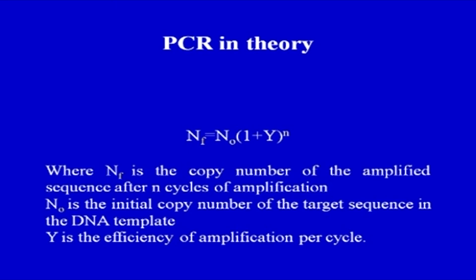All right. So, let us get a little bit into the details of the PCR technique. When amplifying a small segment of a large double stranded DNA template, the desired fragments first appear in the third cycle of PCR, as we have seen in the figure.